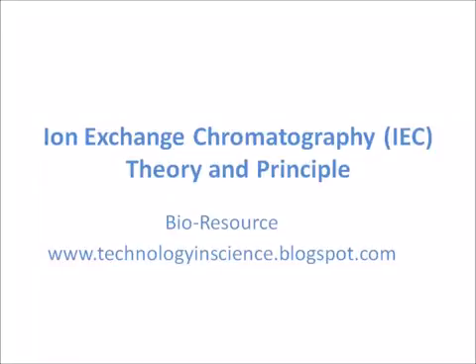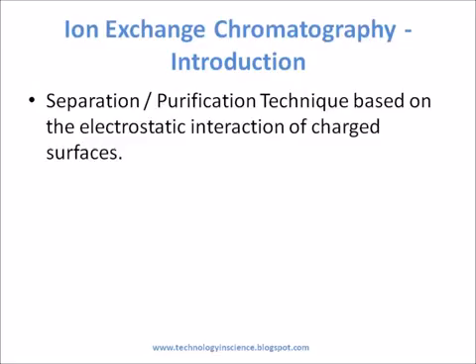Ion exchange chromatography, theory and principle. Ion exchange chromatography is a separation technique based on the electrostatic interaction of charged surfaces.